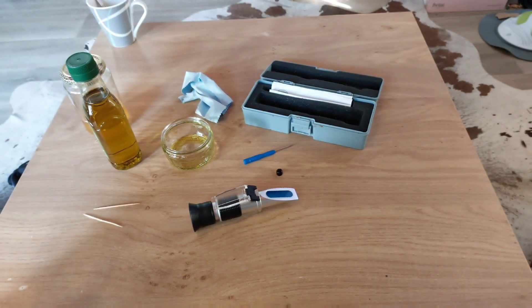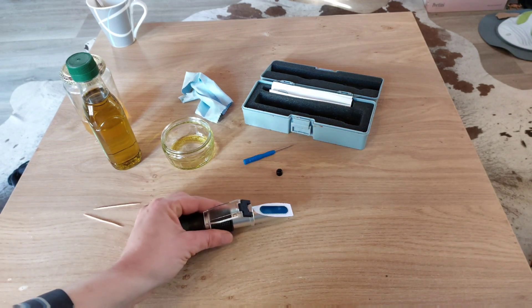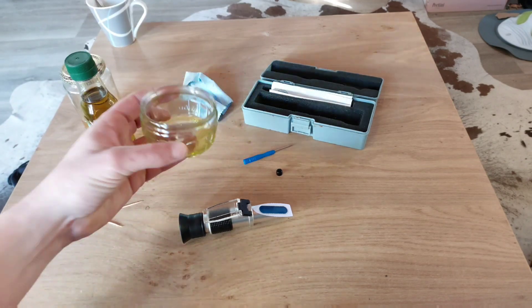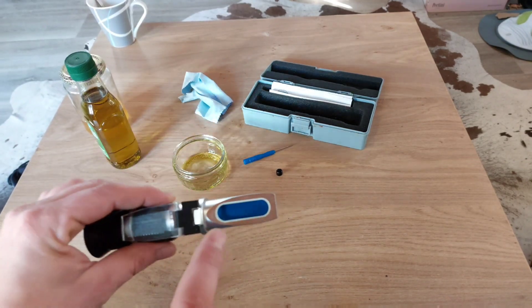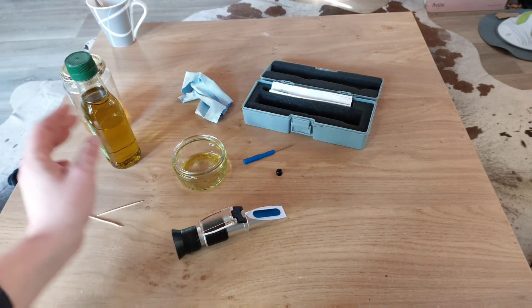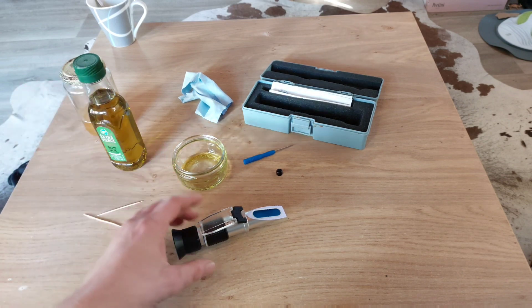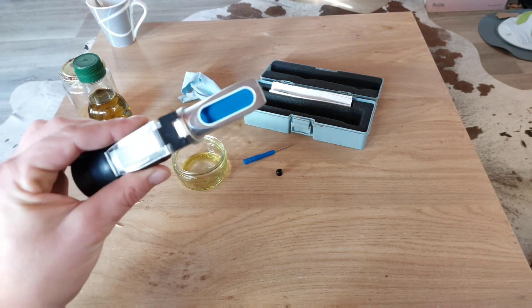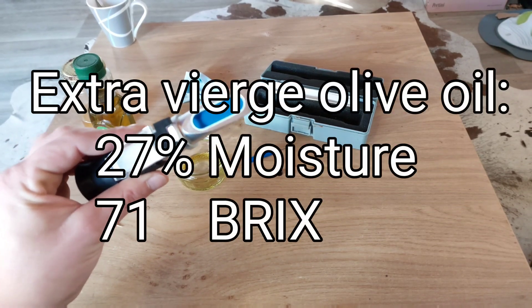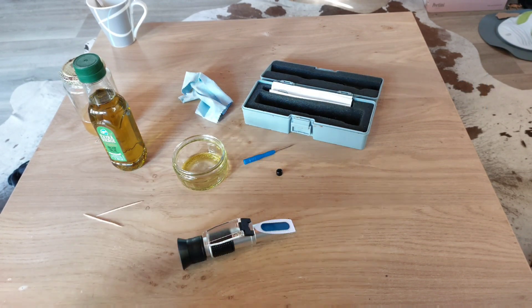The way it works is just the same as with normal calibration. You take some olive oil, put it on the prism, and then you measure. For extra virgin olive oil, the reading on the refractometer should be 27% moisture, or 71 Brix.